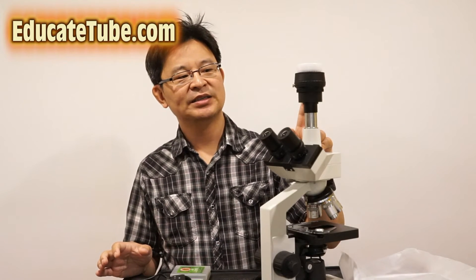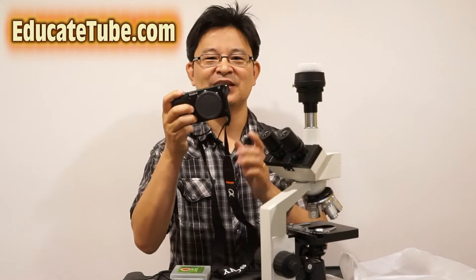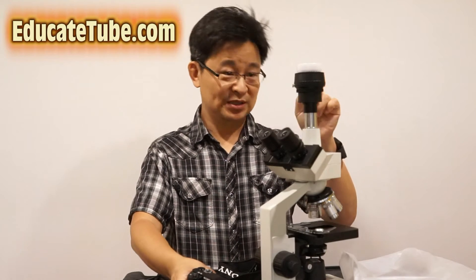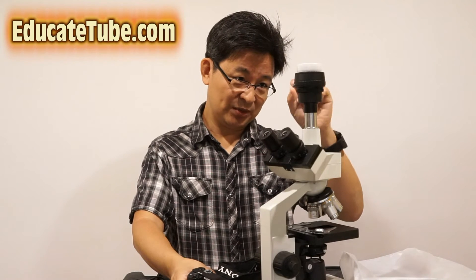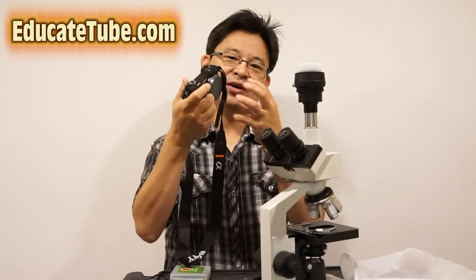I have a Nikon adapter, but the problem is I sold my Nikon camera and went with a Sony. So how do you hook up a Sony a6300 to this Nikon adapter on the microscope? What you need is a manual adapter — a Nikon to Sony NEX E-mount adapter — which you can buy for around 10 to 20 dollars.